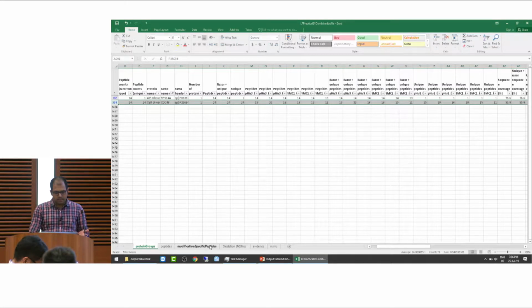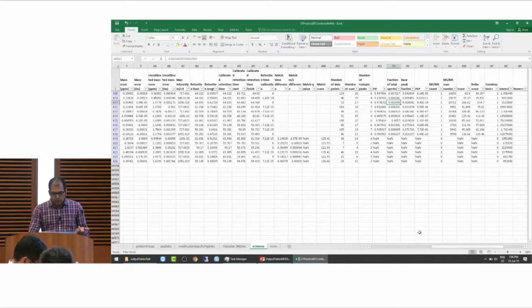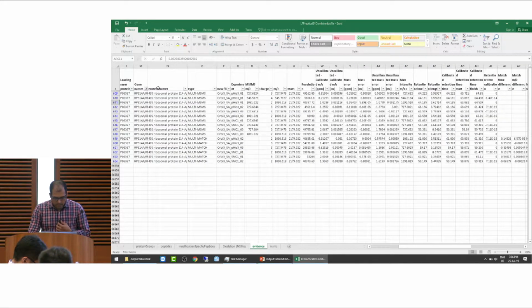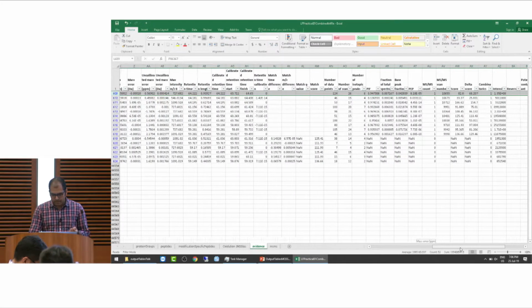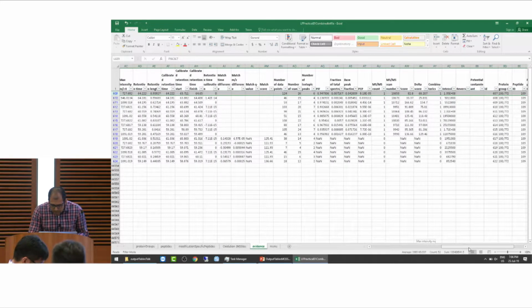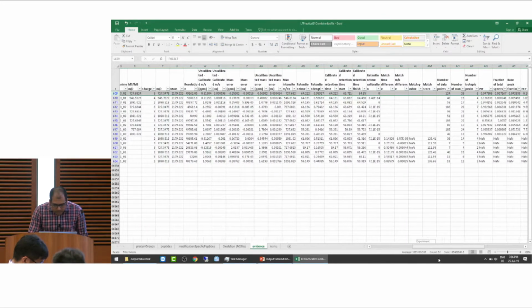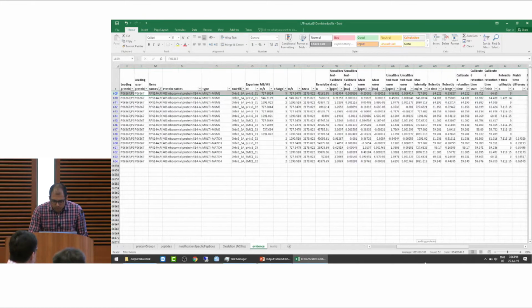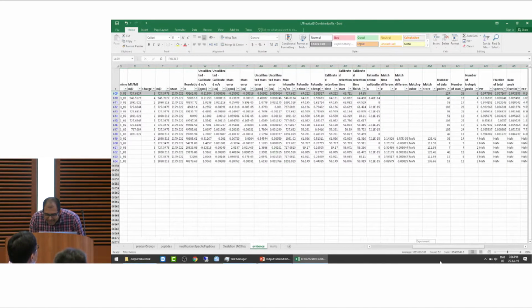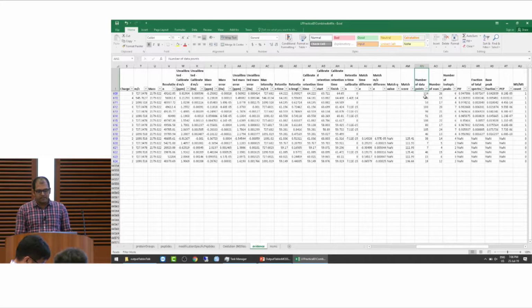So let's say we have a low abundant protein and we have one peptide identified. We can actually go, for example, to the evidence table and see, imagine that's the only peptide you get, and the only evidence from that particular protein, and then you can look at this number of data points. I cannot do this with 100 people watching, sorry. Here, number of data points. So in this case, it's like 124.